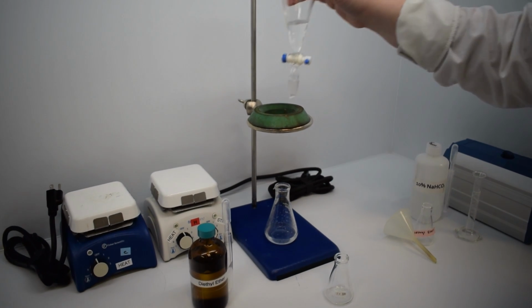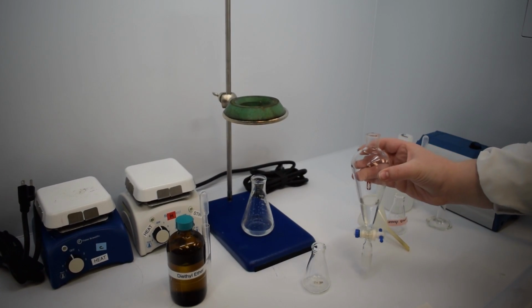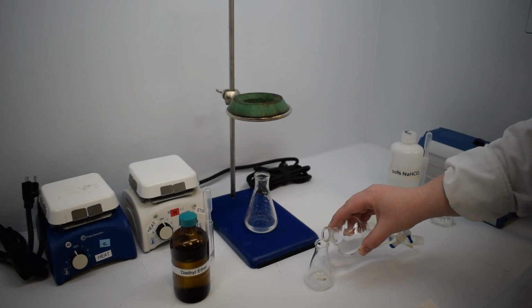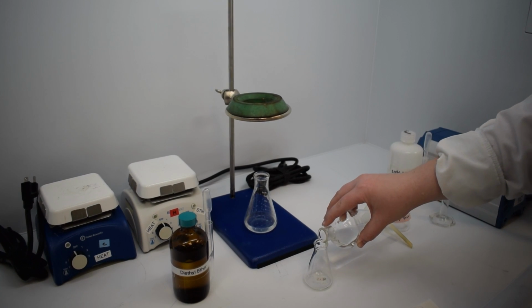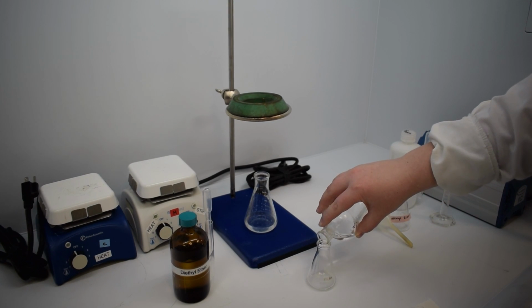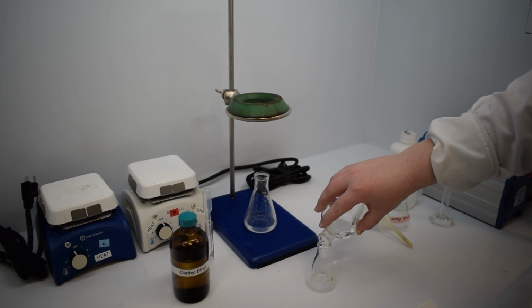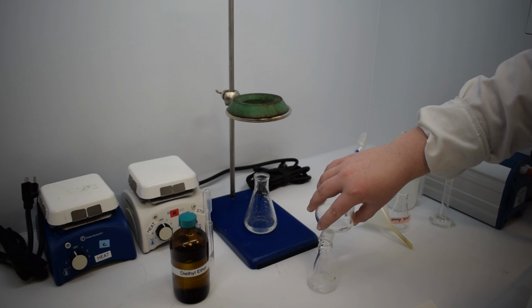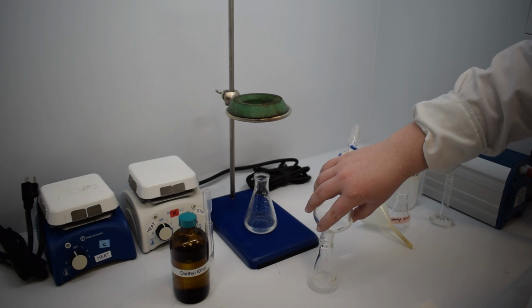Now that we've drawn off the second aqueous layer into the waste flask, we can take our organic layer that we have isolated and transfer it to a clean Erlenmeyer flask as well. It's important to note that we are pouring the organic layer out the top of the separatory funnel, because if you were to drain it off the bottom, you would contaminate it.